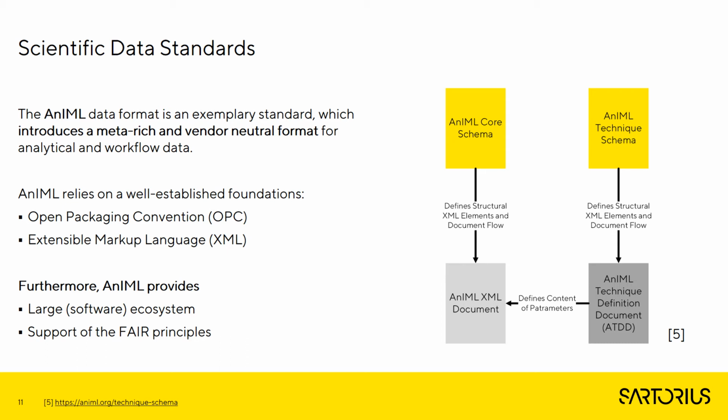Such a technique restricts and enforces the use of AnIML document components, which results in a clear and defined set of data. According to the AnIML organization, the standard already provides a large ecosystem and fully supports the FAIR principles, which were introduced by Wilkinson et al. in 2016. In general, the acronym FAIR is a hot topic to increase the value of scientific data. FAIR stands for findable, accessible, interoperable, and reusable, and basically reflects the need for a commonly agreed and open vocabulary and rich set of supporting metadata.